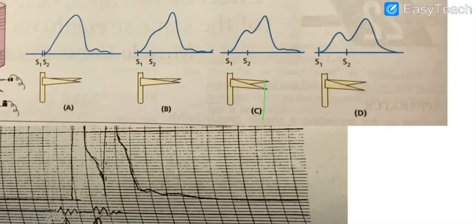In the first picture, S1 is the first stimulus, S2 is the second stimulus. In the first picture A, we are providing the second stimulus during the latent period. So, there won't be any additive effect of the second stimulus. We will get the simple muscle twitch like this if we just provide one stimulus or provide both stimuli during the latent period.